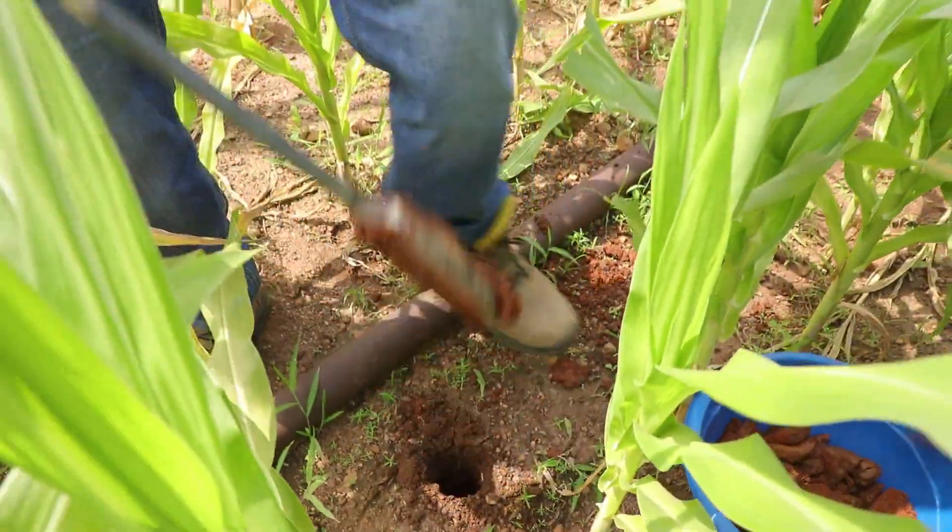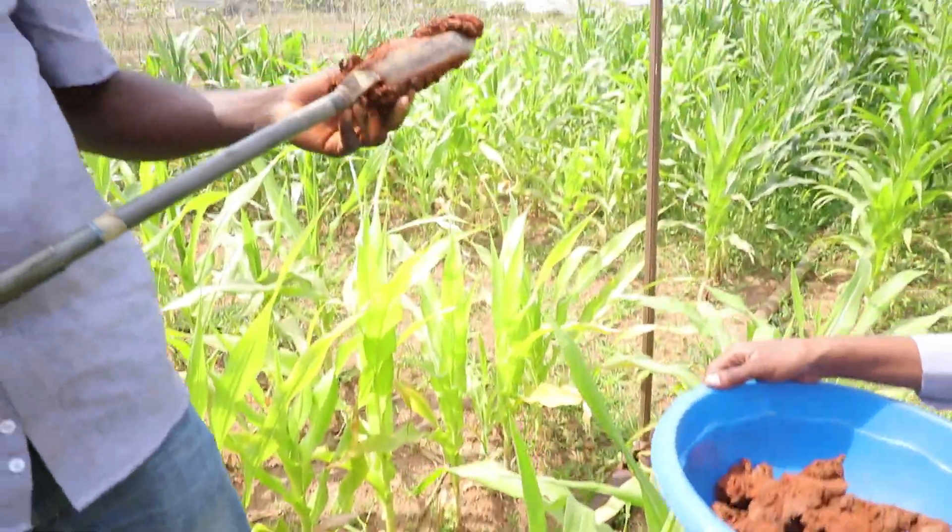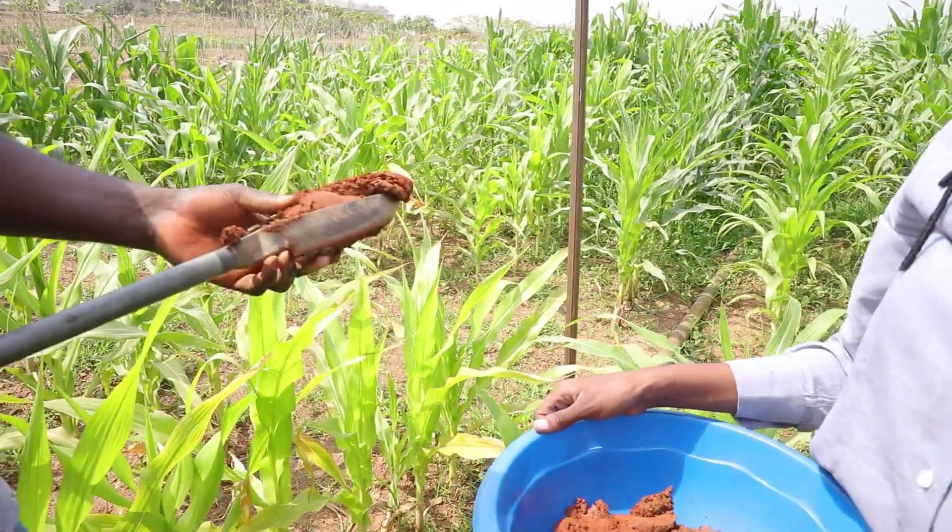Also, while taking the subsoil sample, empty the auger regularly at every 10 centimeters. This will keep the auger from overfilling, which will prevent the auger hole's volume from distorting.